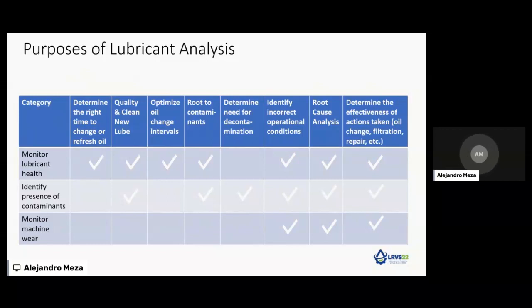Why should we do this? We have experience of users that implemented this quality control, and they sometimes found discrepancies in the product that were discussed and resolved with the lubricant supplier. Another possible inspection for the incoming oil is the cleanliness. We can monitor particle counting and moisture to see if that lubricant needs to be filtered or dehydrated before we put it in the machine.